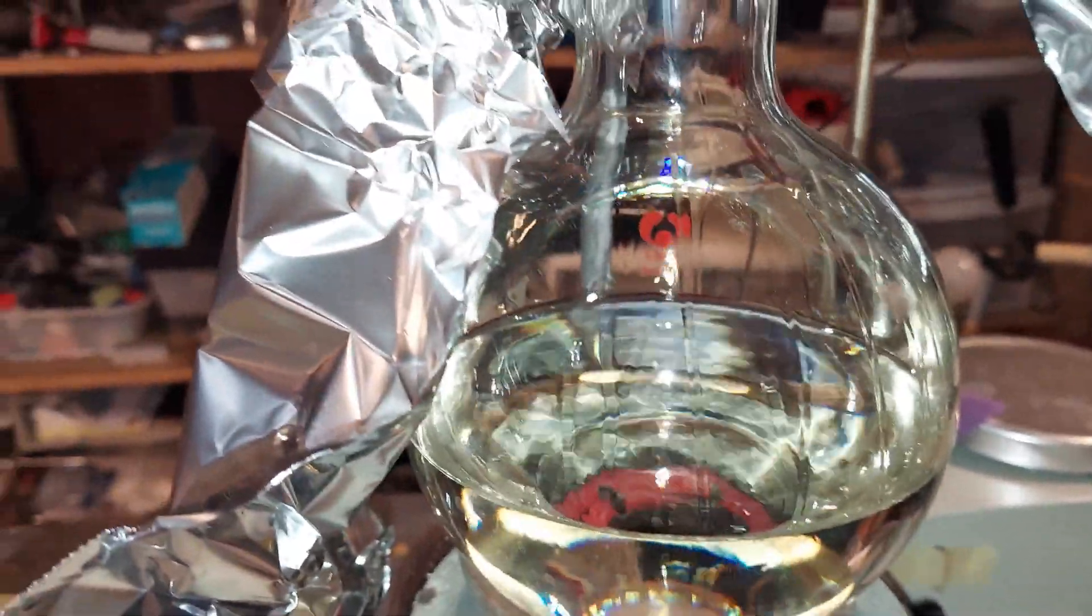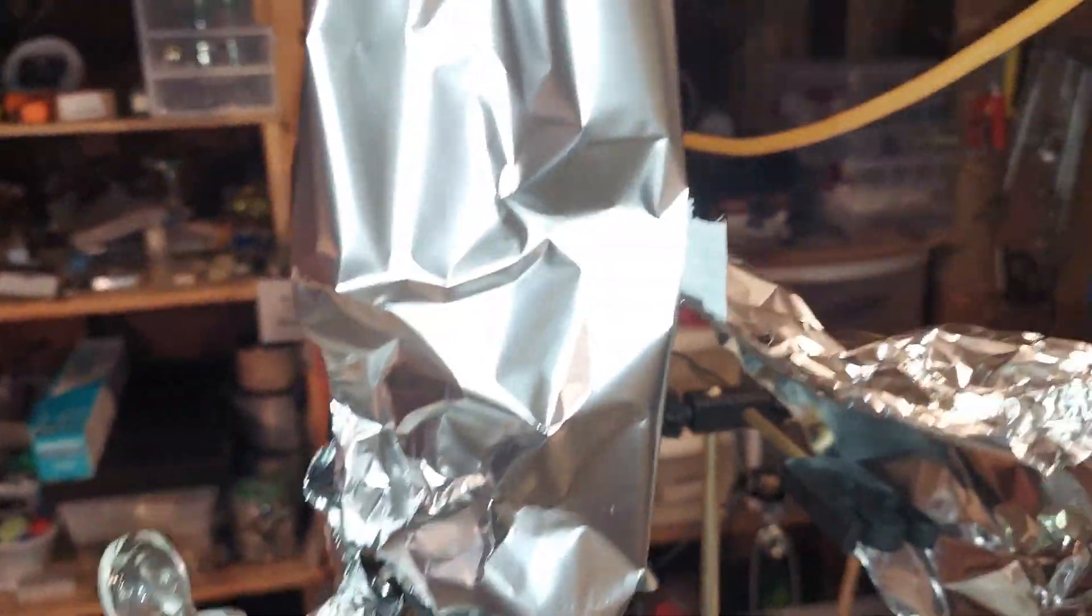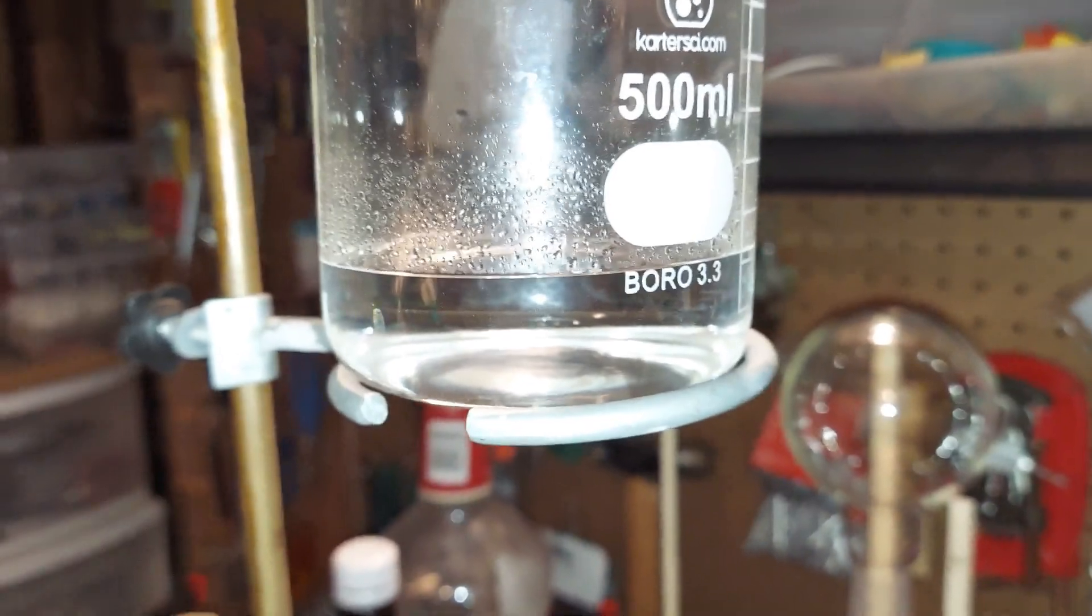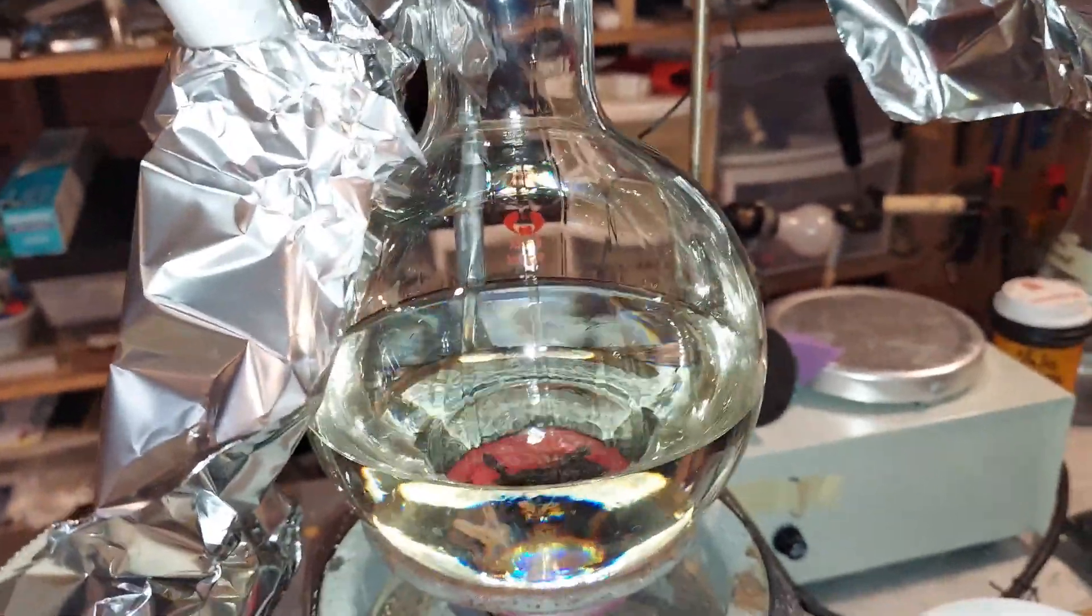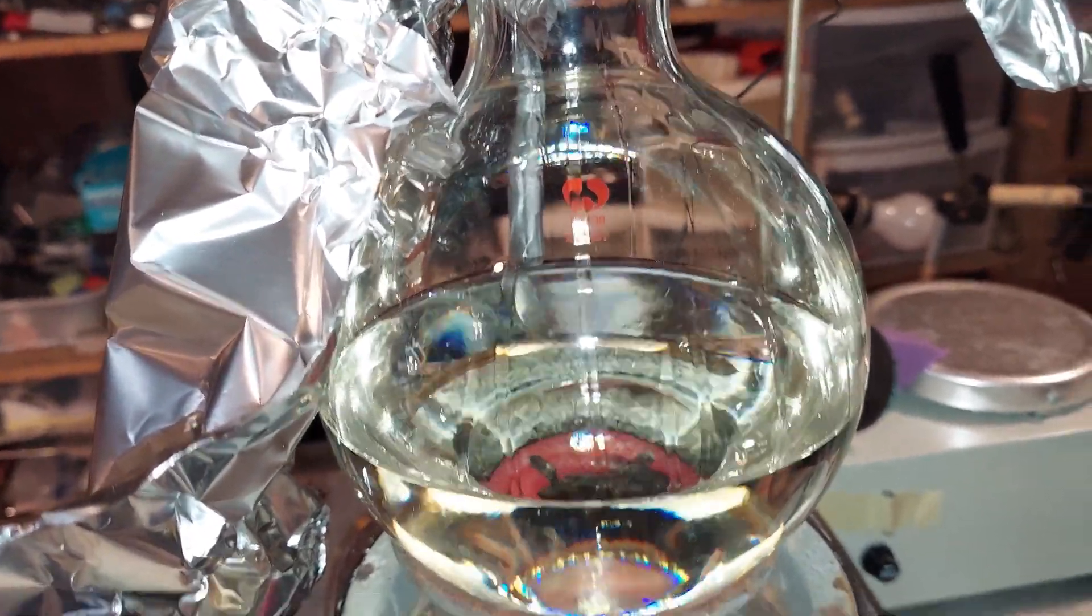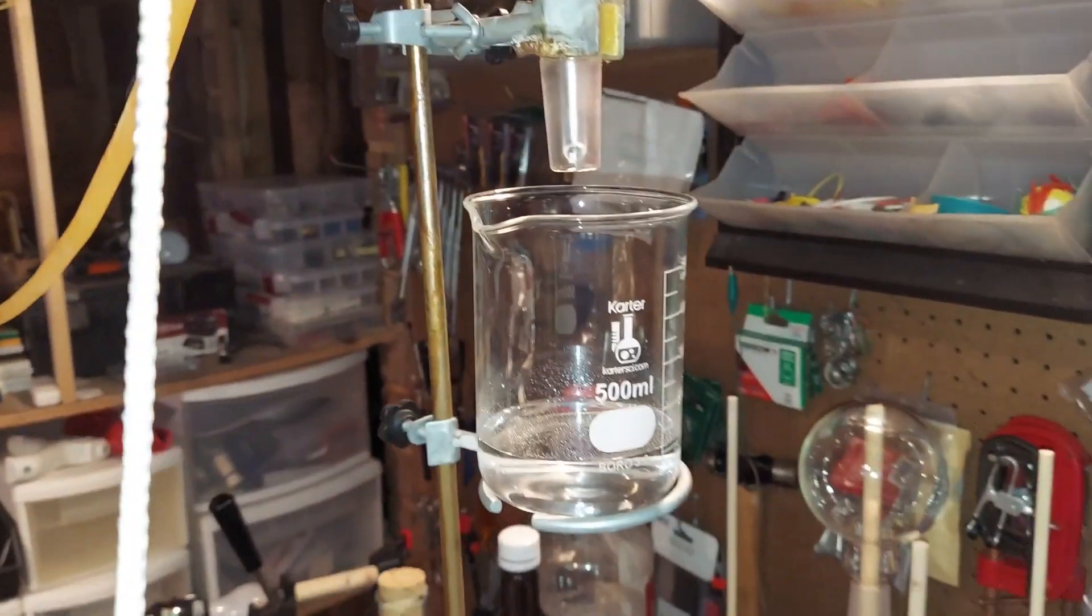The nitrogen dioxide gas, the brown gas, is driven out of the solution at first. You can see over here what's first dripping out looks pretty clear. That's water with a little bit of nitric acid, so it's pretty weak nitric acid. Once the temperature reaches 120 degrees, it's about 102 right now, the nitric acid will start coming over and I'll remove the water.